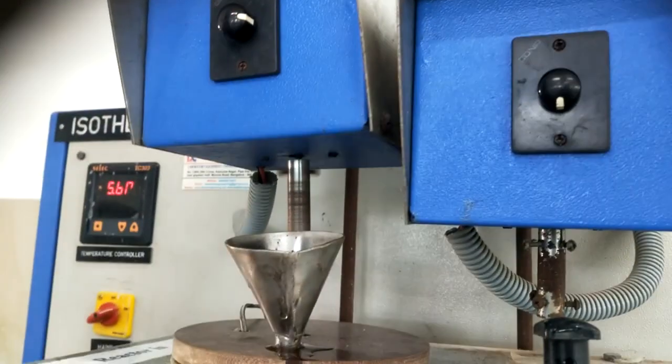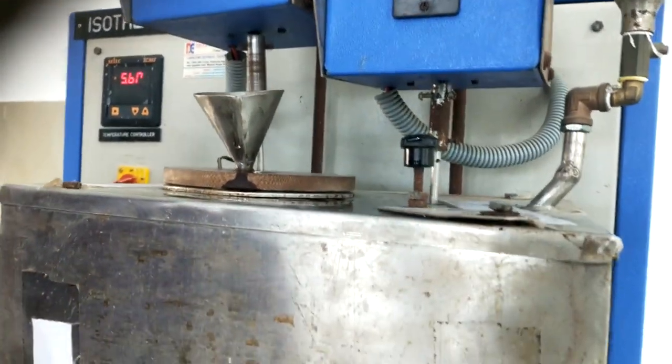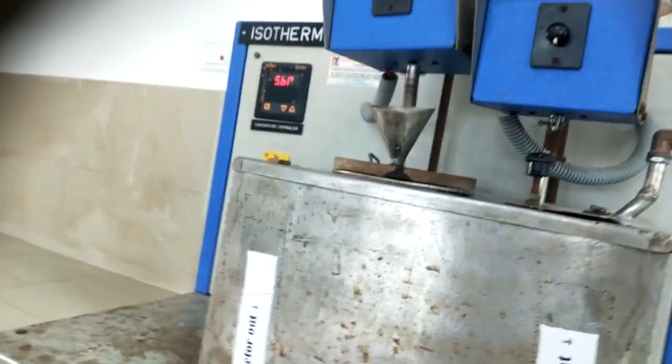We have to start the stopwatch parallelly. So with the stopwatch, we start the time. Every minute, we will be withdrawing a 10 ml sample from the system. So we are waiting for the time.